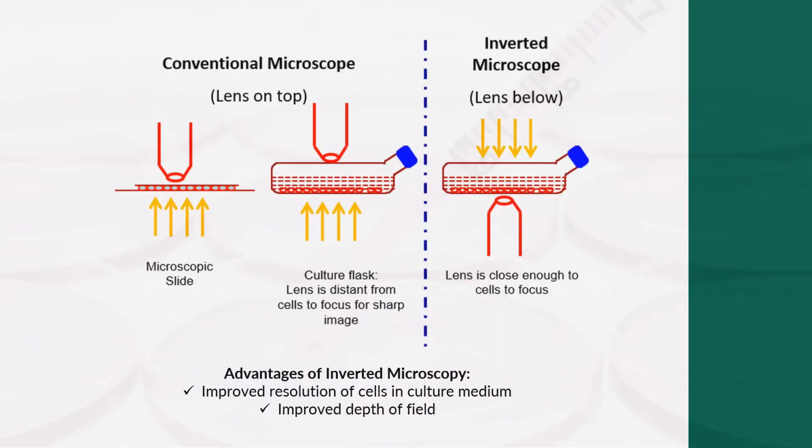Okay, so inverted microscopes, as you know, are very much used in many applications in life sciences. One example is cell culture. Why? Because cells are often grown on the bottom of the dishes, and then they are filled with an aqueous solution. So they cannot be seen clearly from above, right? So inverted microscope designs provide several advantages for cell culture applications particularly.